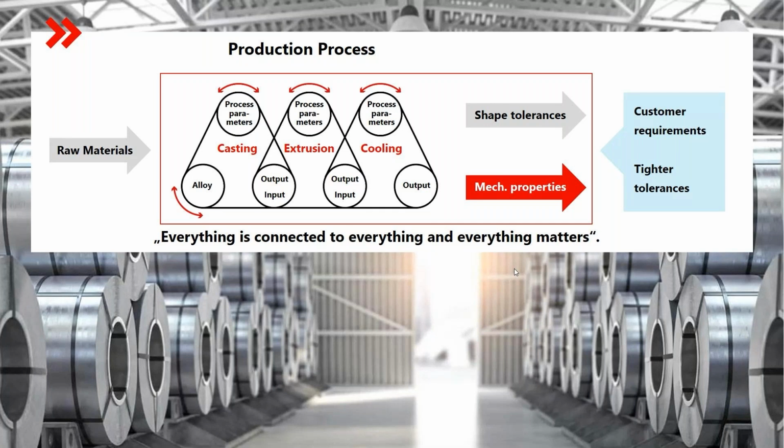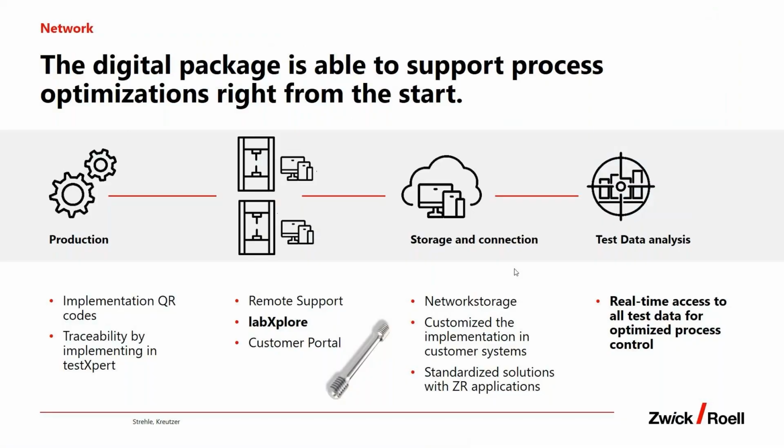And along this process, and this is one possible process, you have access from everywhere to all this data at any time. And this is again the picture. You have a production which is somehow involved in this process.